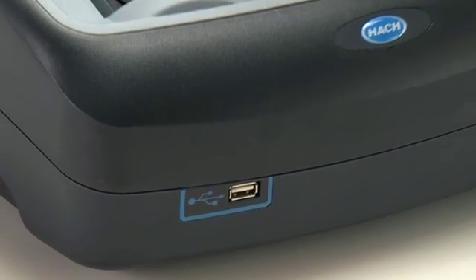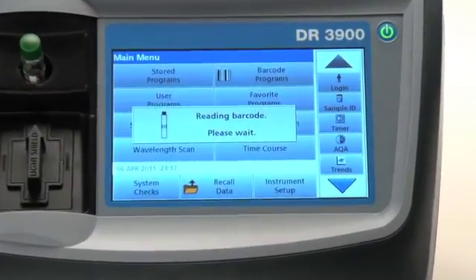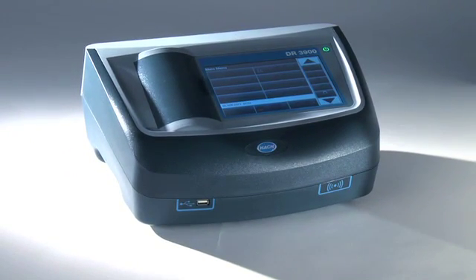Easy connectivity to any computer or water management system through one LAN connection and three USB ports, and a sample tracking system that tracks your sample IDs effortlessly. It is without a doubt the best spectrophotometer on the market and the future of water analysis.